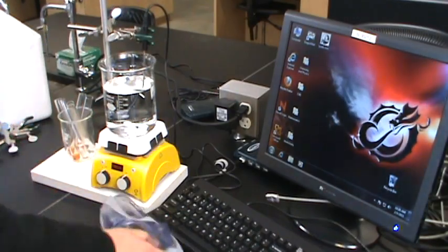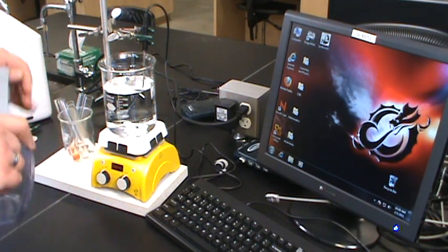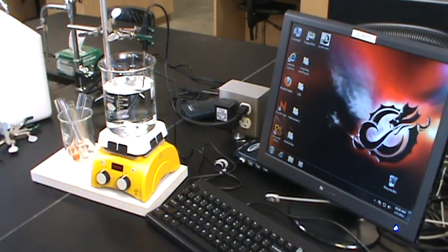And we're going to do that with a cool bath. Cool bath isn't that hard to set up, but it's maybe not the most intuitive. So let's take a look at how we're going to set that cool bath up. Alright, so I have everything set up for my cool bath. So let's take a look at how we're going to make that and really maintain it.